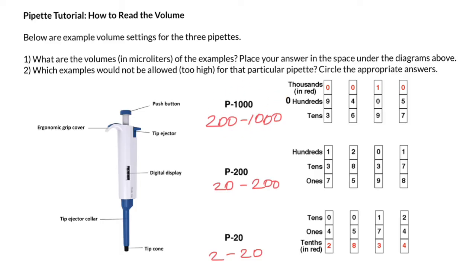If we have micropipette P1000, these numbers here stand for not 93 microliters, but 930 microliters. Because this is going to be thousands, this is going to be hundreds, and this is going to be tens. Why are the first numbers here shown in red? Because we can put a decimal point here.